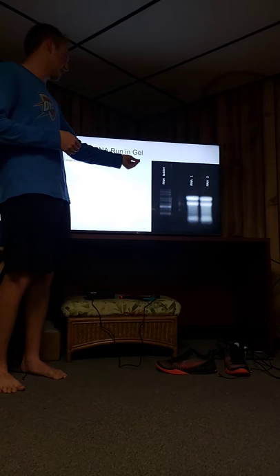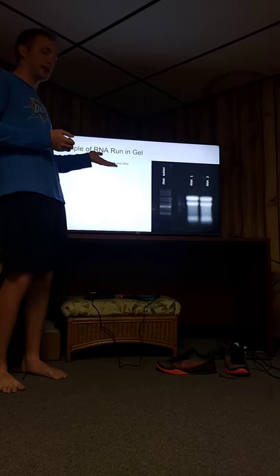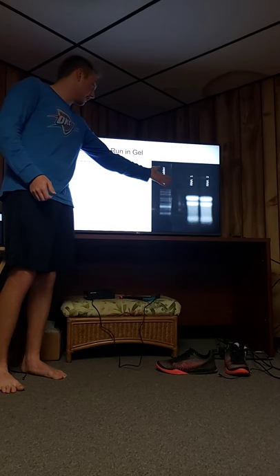So here I have an example, the picture is not the greatest, of what you would run with your samples in order to help determine size. So you have your RNA ladder over here, and then you have your subunits over there.